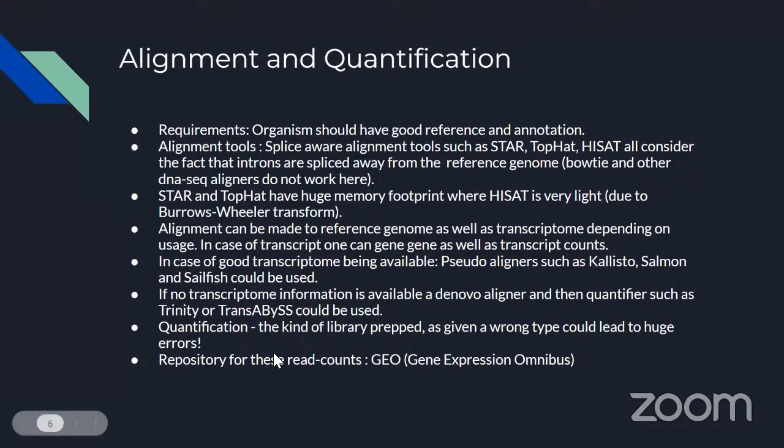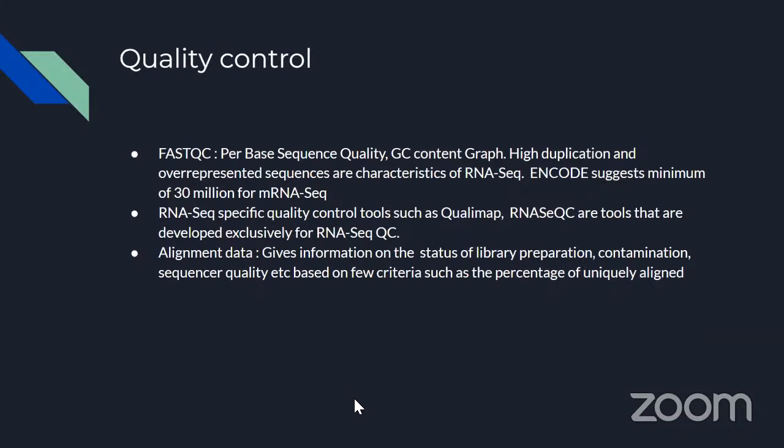I also want to tell you that these read counts from the RNA-seq analysis have a repository in NCBI, and it's under the Gene Expression Omnibus. So yeah, let's come to quality control.